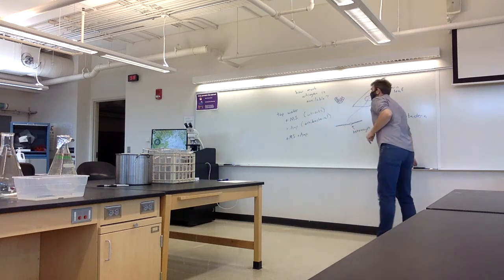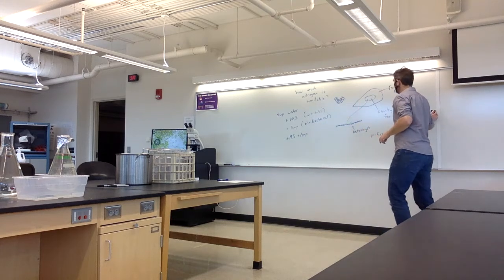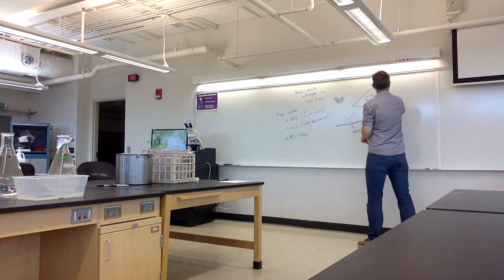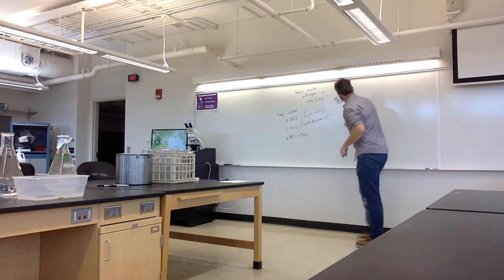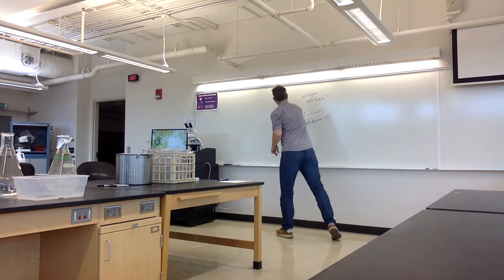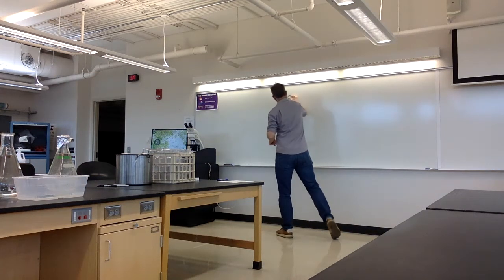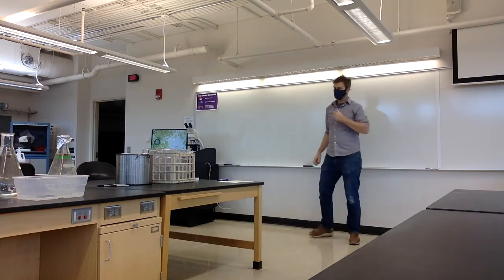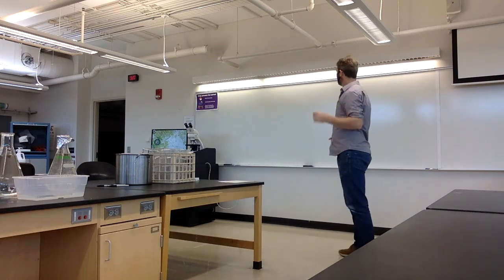So I guess that's a nice entry into the experimental part of this. So how should we set up an experiment? So I guess regardless of what we expect or whether we see an effect, we should talk about how we set up an experiment to be able to see an effect.